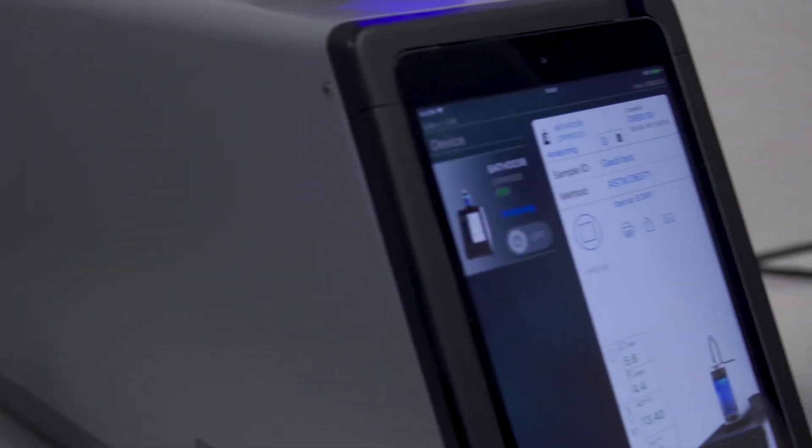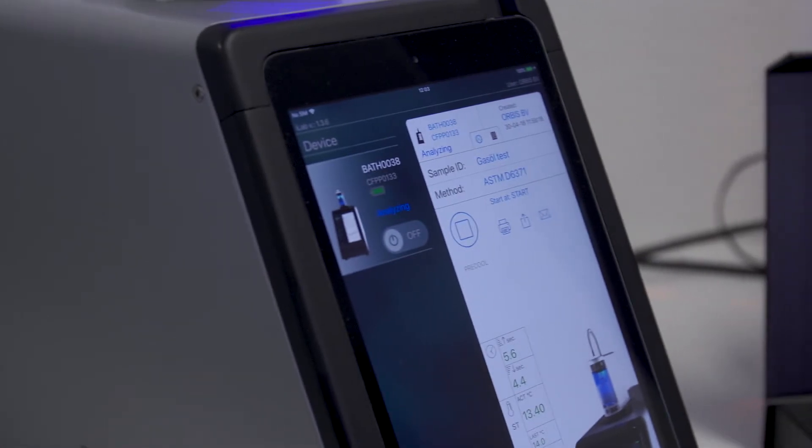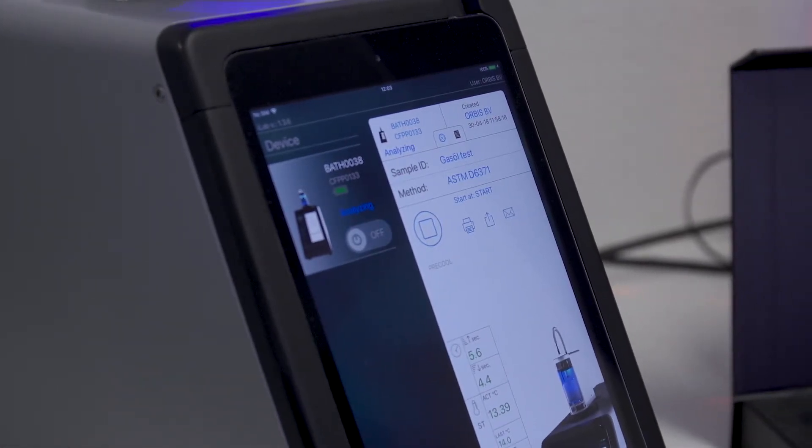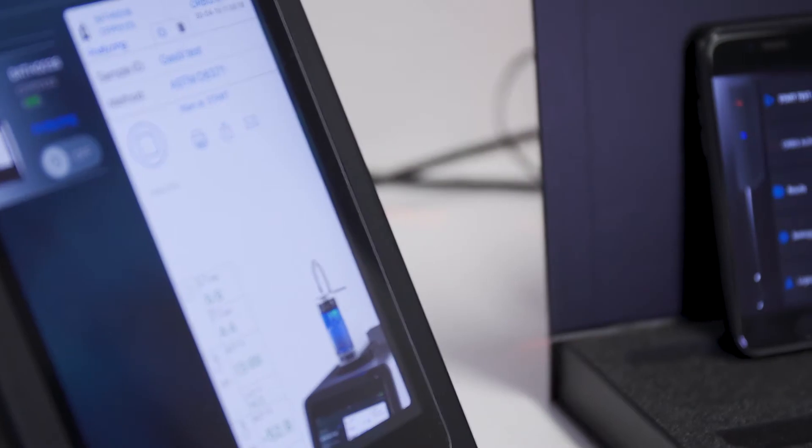A unique feature of the Airstar platform is the ability to combine multiple cold blocks and heads together. For instance when a customer has purchased the cold filter plug point instrument only, he can add just one cloud and pour point head to make it a fully functional three-in-one tester.